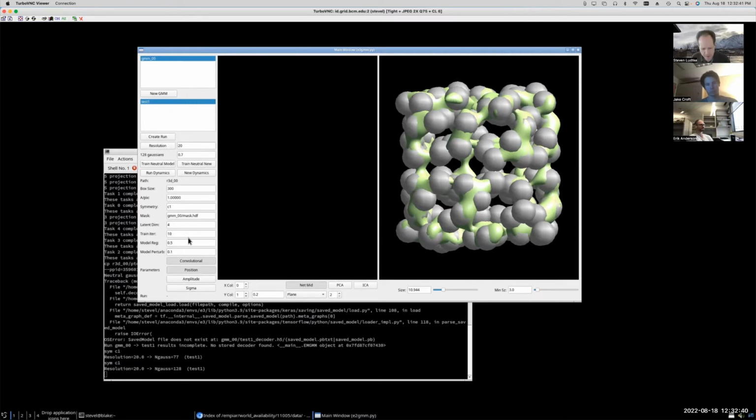Right. So I've picked my parameters. Before I start training any networks, I also want to make sure all the stuff down here is correct, because you have to retrain the network if you make any changes to it. So I don't want to use a mask. It defaults to taking the mask, if there was one from the refinement project, and copying that in. Since I don't have one at all here, it's kind of dangerous to leave that. Often you'll want to erase that. You can use a mask, which defines a particular region you want to focus on, but I would say that process is still not optimal.